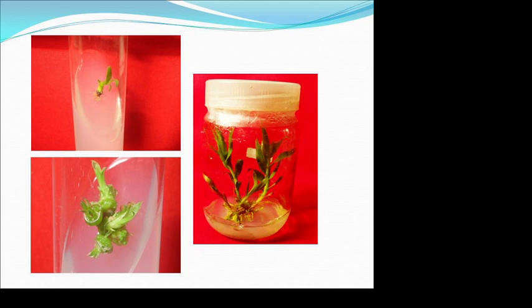Then you can see here, once the cytokinin was balanced, there was shoot formation, and once the shoot formation was over, we started working with the auxin for the root formation. And if you see here in this jam bottle, you'll see that rooting also has been developed, and quite good rooting is there.